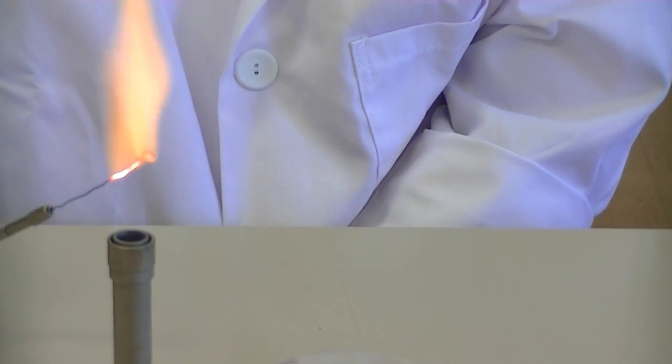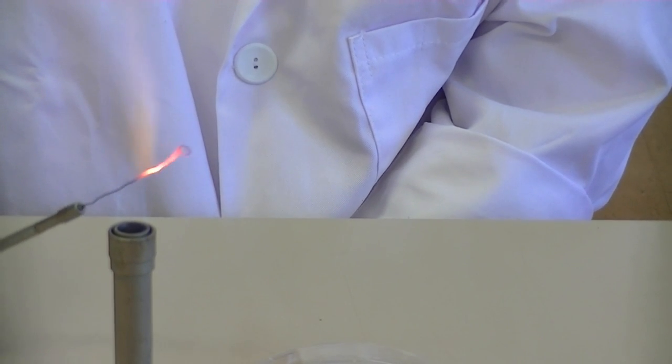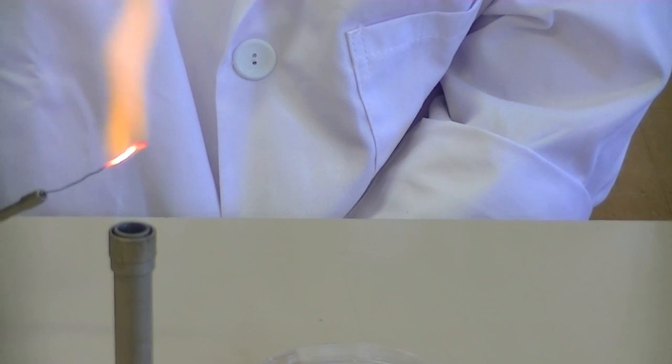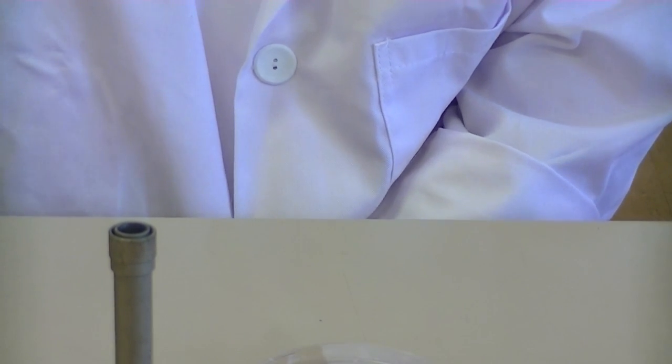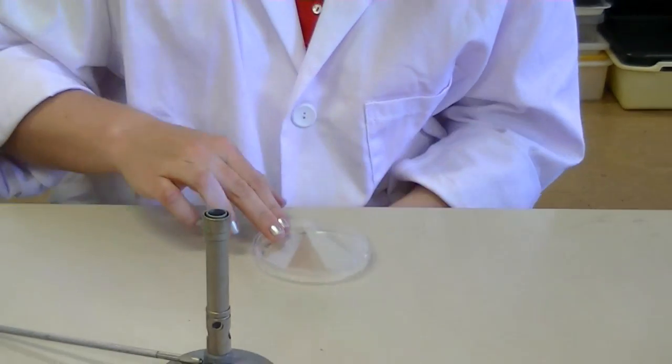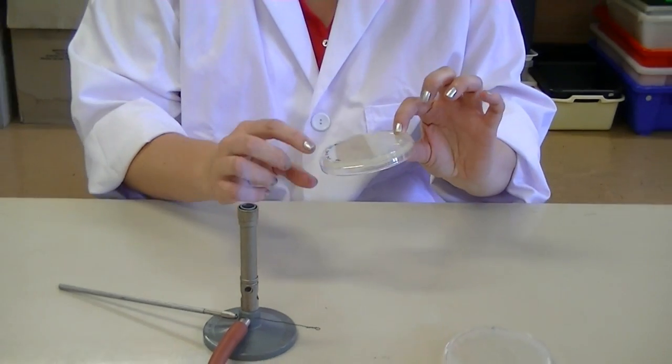Flame your loop once you've completed the procedure to make sure you remove any bacteria that might be on there, and then place it at the base of your Bunsen to cool for later on.